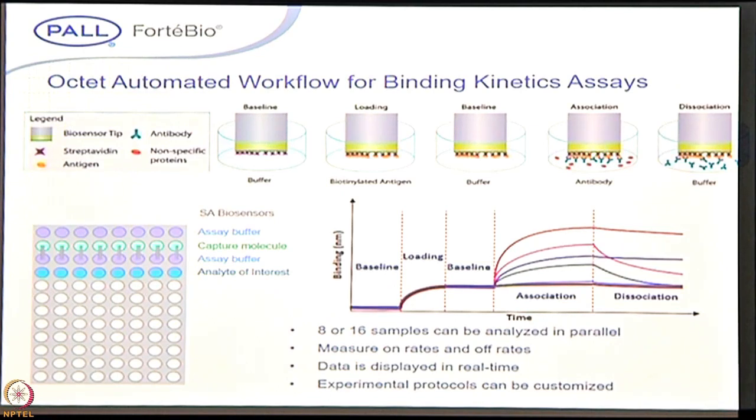As I mentioned, some molecules go to the sensor surface, and you can see the change, right? The phase shift. So you can see the loading response. When the same sensor moves back to the well containing a buffer, it is just a baseline, there are no molecules binding, and unbound molecules get washed off. The sensor next moves to the well containing the analyte, and you can see the response. The same sensor goes back to the well containing buffer, and the bound analyte gets washed off.